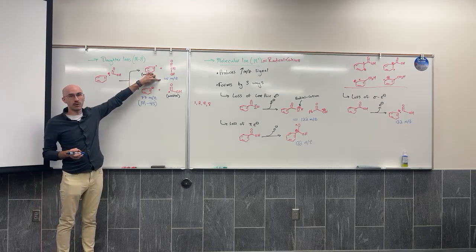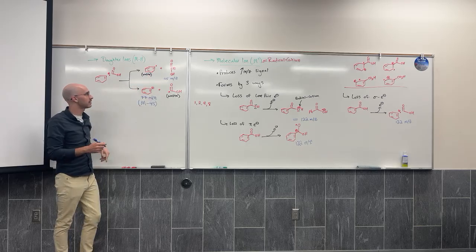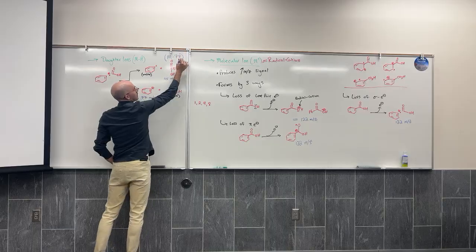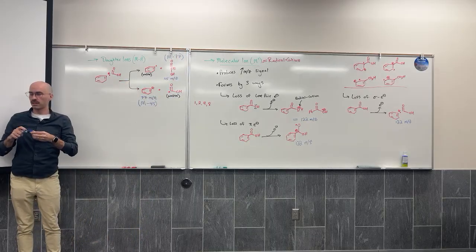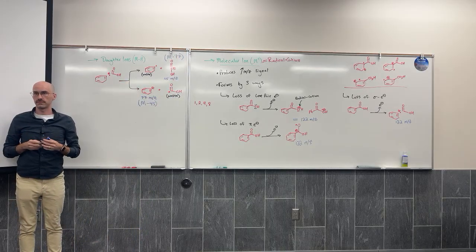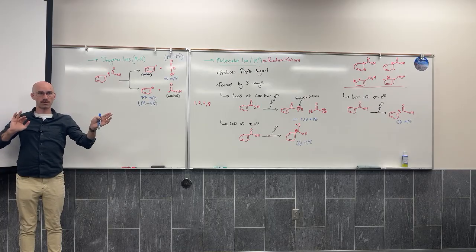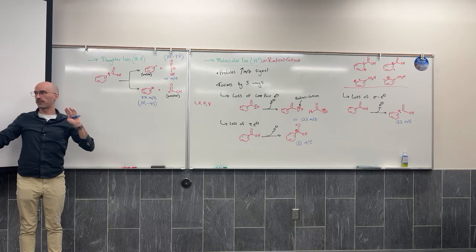What about this signal at 45? What could we have labeled it as? The mass minus 77. The molecule less 77. And of course, these are connected to each other. One forms because it was just the alternative of the other.